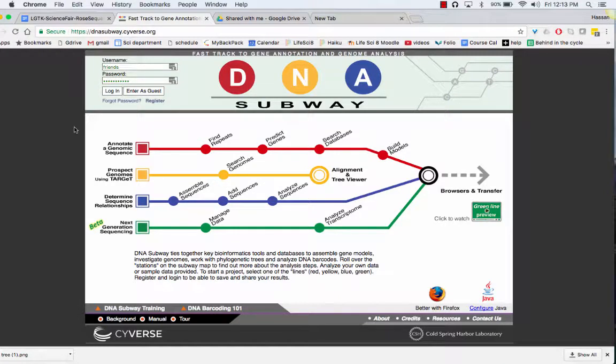Hello, this video is going to show you how to align DNA sequences to create a cladogram in the website DNA Subway.